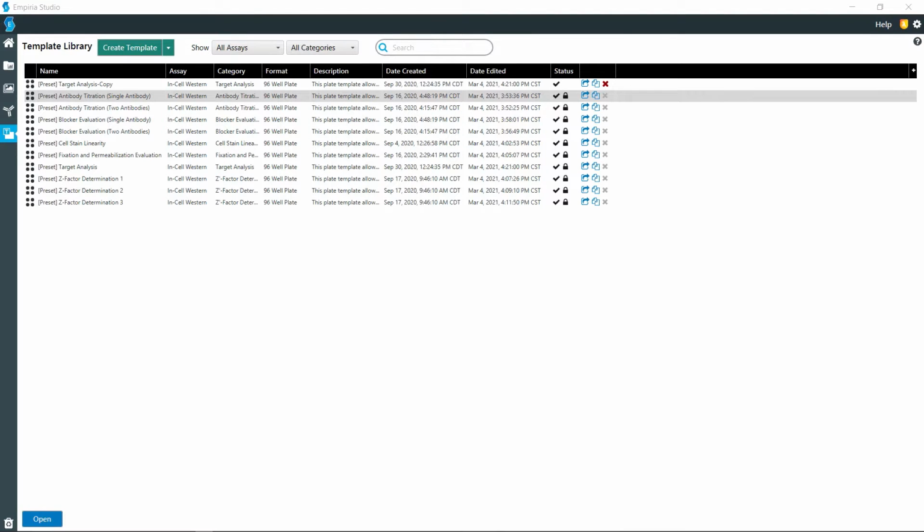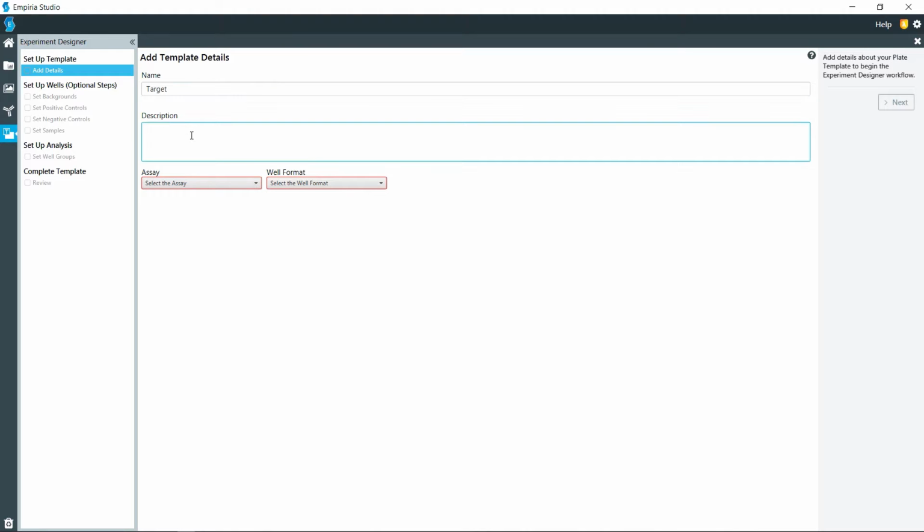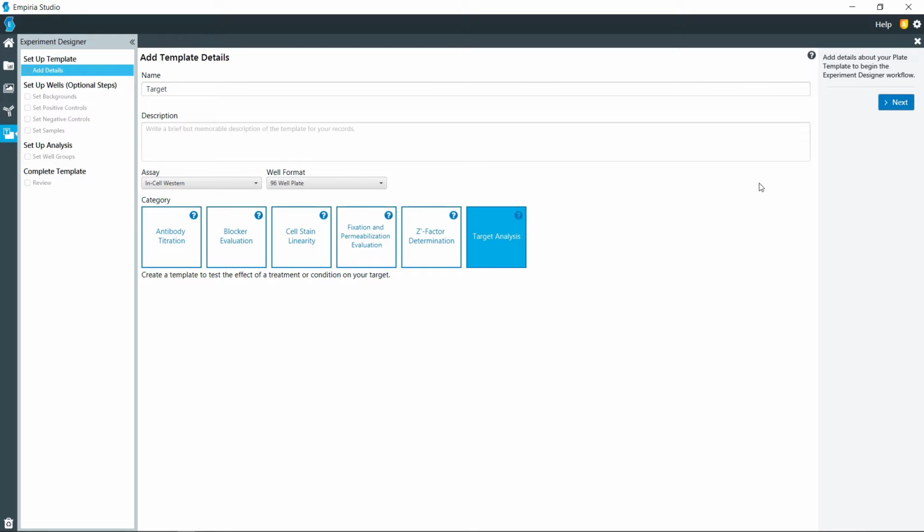Hello, in this video we'll be going through the steps involved with creating a template for target analysis for In-Cell Western, ELISA, or cell assays. So up here at the top you click on Create Template, type in whatever name that is useful for you and give it a description if need be. And I'm going to choose In-Cell Western for this one, a 96-well plate, and then target analysis.